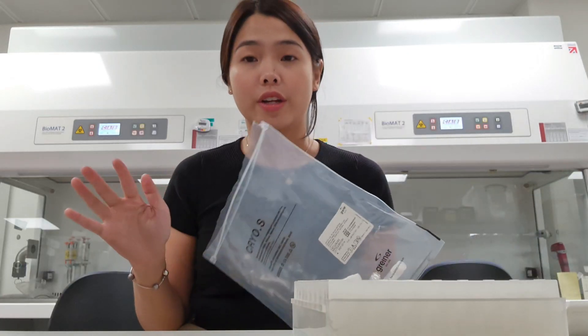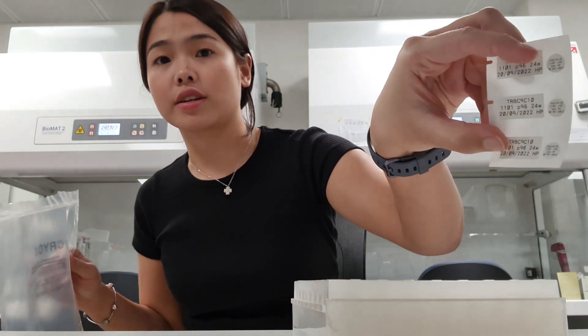I've finished printing some of the labels, and here's the stack. I'll be needing to stick each of these stickers onto one of the cryovials.